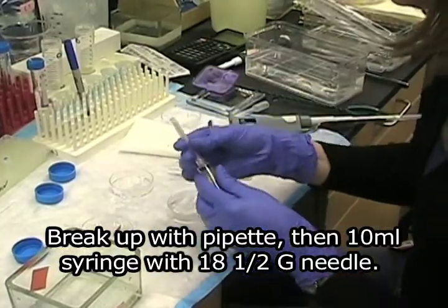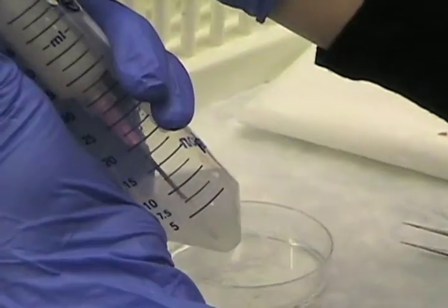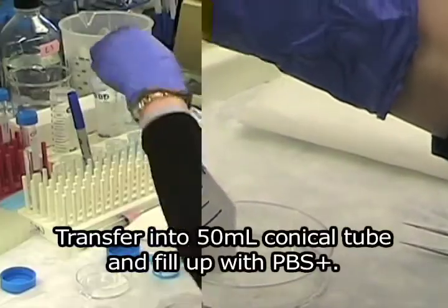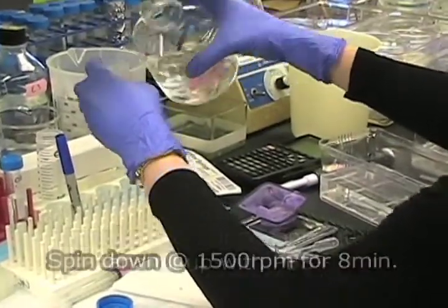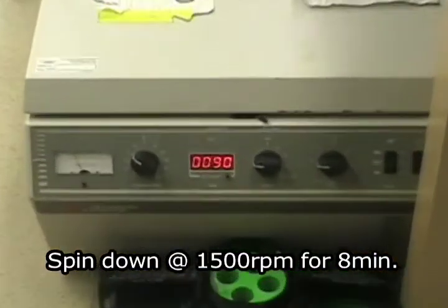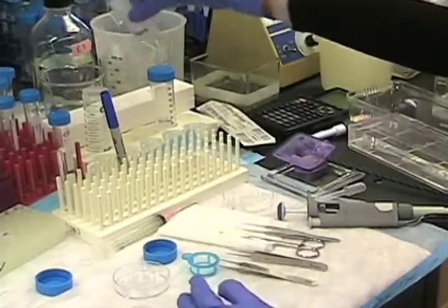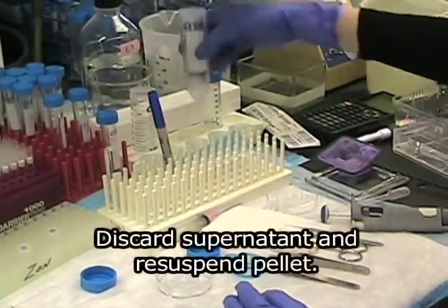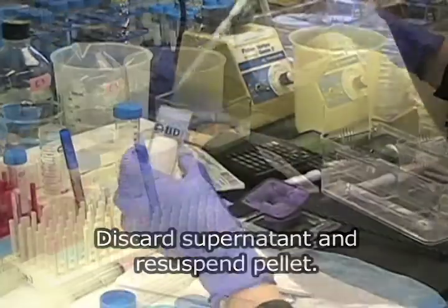Break up with 10 ml syringe and 18 and a half gauge needle. Transfer to a tube and fill up with PBS solution. Spin down at 1500 RPM. Aspirate out the supernatant. Resuspend in PBS.